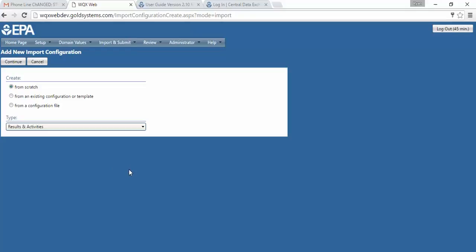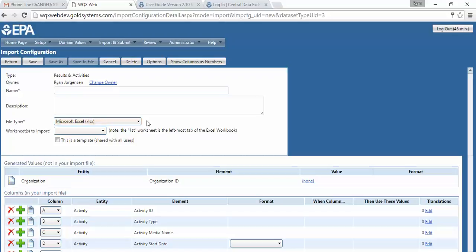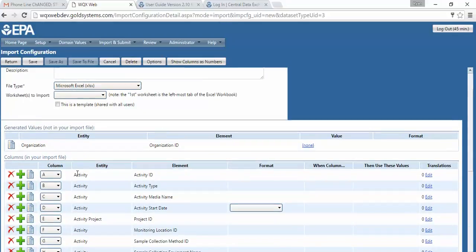there's a few minor layout changes to point out. One fairly minor one is we've just consolidated all the buttons off to the left side here. So in the previous version there was a button or two out here in the list, particularly this pick list button. We've just moved them all to the left to be a little more consistent and concise.